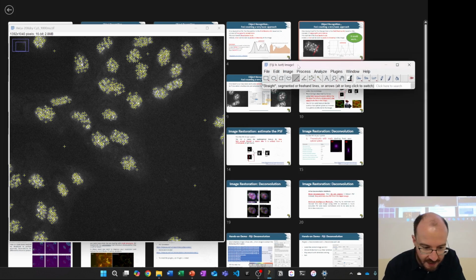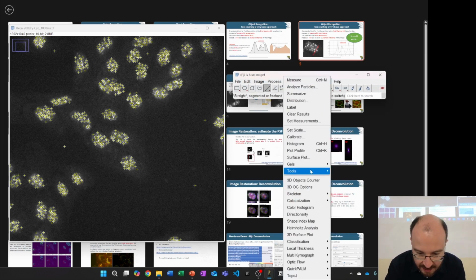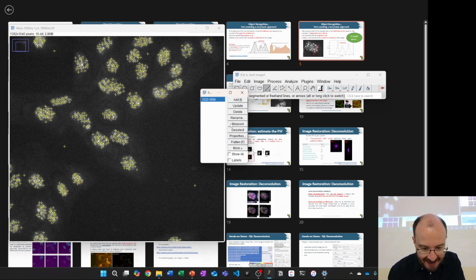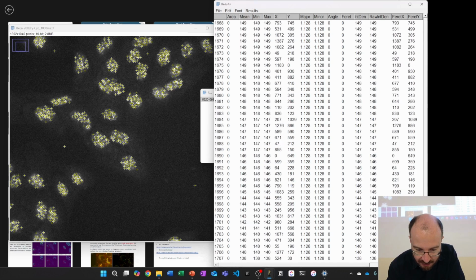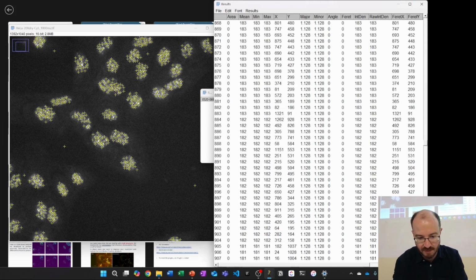Okay, now I've got all of these selections. These are point selections, so I can do the same things I did yesterday. I can go to Tools, ROI Manager, and then add them. Interestingly enough, it just adds one item, but this one item actually corresponds to everything. So if I click Measure, it might take a bit of time. Yeah, there you go. There you can see it's found all 1,707 of them. It has listed them individually in my measurements.